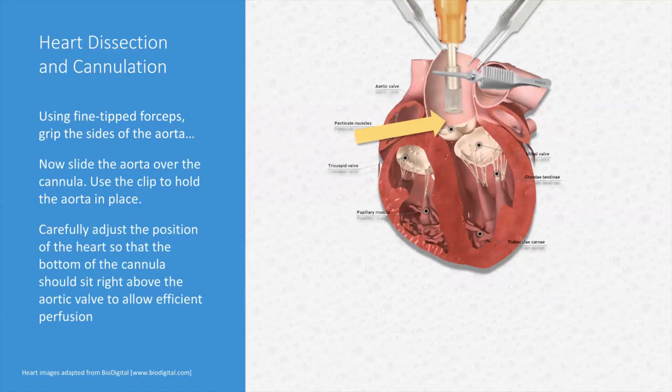I always recommend that anyone who is new, or a first timer, dissect a couple of hearts just to become familiar with the anatomy of the heart before you continue this procedure. This will help you tremendously to determine the proper position to secure the heart and make it easy to put it onto the cannula.